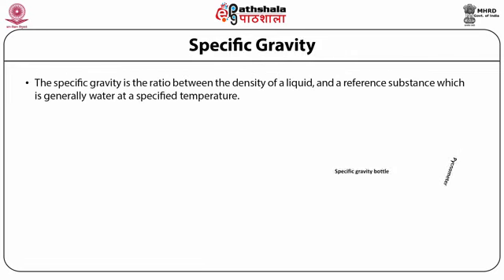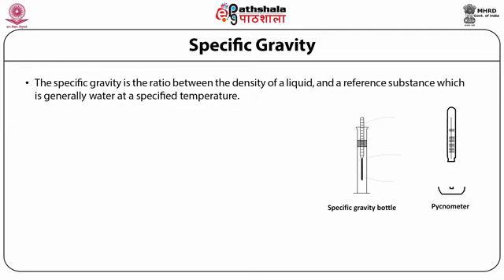Specific gravity, as we know, is the ratio between the density of a liquid and a reference substance, which is generally water, at a specified temperature.